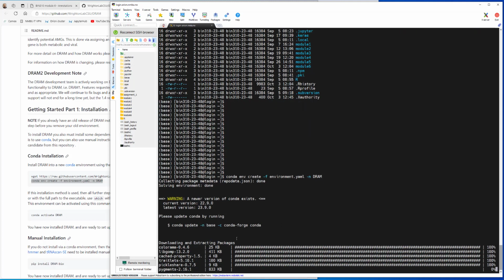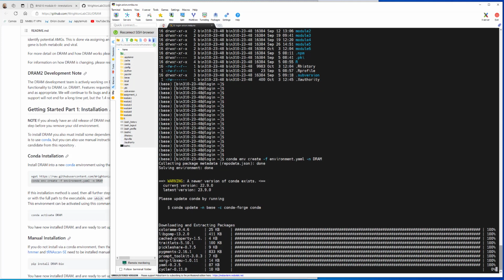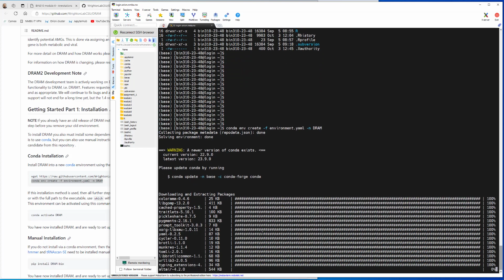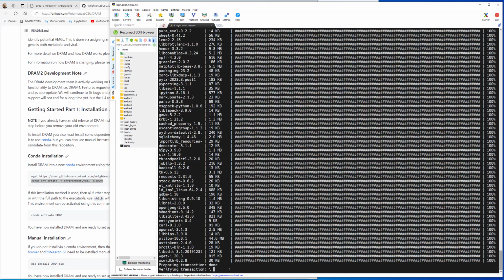Yeah, and now it starts to actually download the software. And don't bother about this warning here. Newer software exists. And this can take some time because there are lots of dependencies here now. Yes, this was a horribly long list of dependencies. And hopefully it's all being downloaded and the transaction is verified here now.